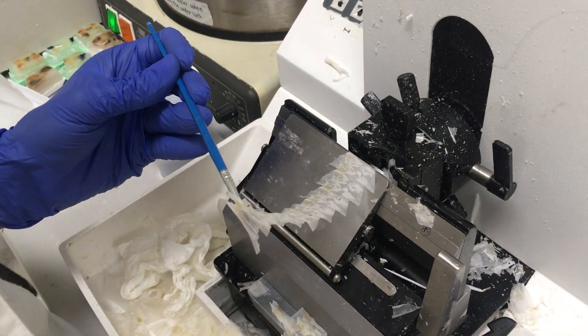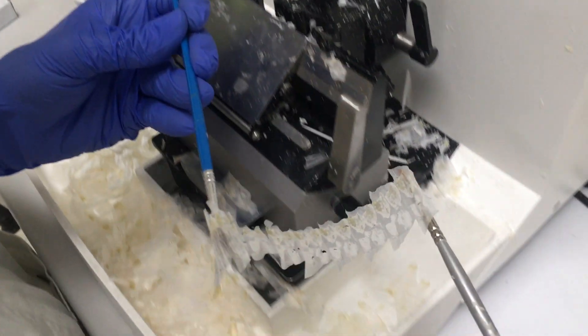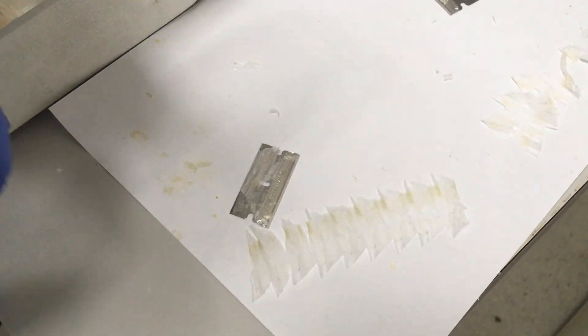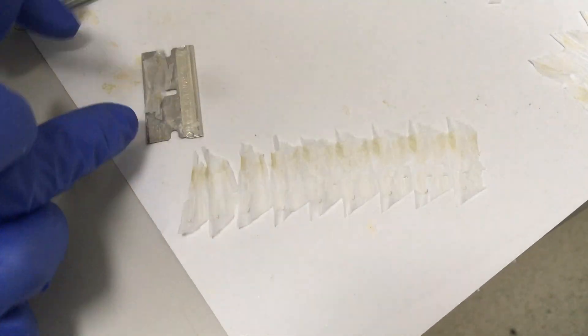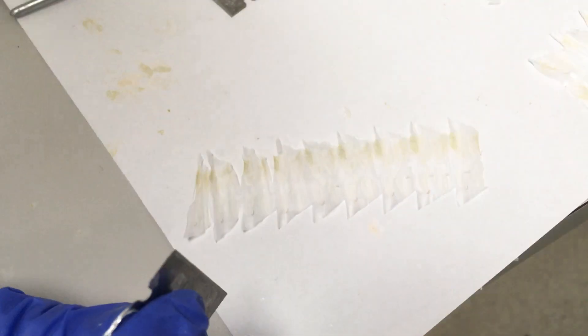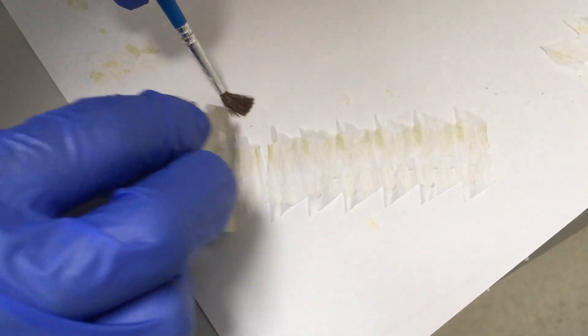And the one that I'm happy with — at least one of those — I remove it and transfer to a piece of paper and then use a razor blade to cut my section. I want to get one that's close to one of the first ones that I cut, because that would most likely have the most intact egg structure.